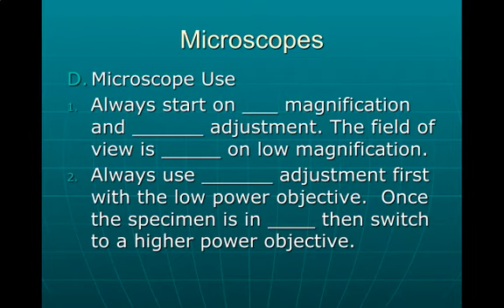Okay, next we're going to look at microscope use. These are rules that you need to apply when using microscopes. Please make sure you study over these rules. I constantly see students using microscopes incorrectly, and guys, it can mess up your experiment, it can cause damage to the microscopes, and it can just be a hassle for those that use the microscope after you. So please make sure that you're looking at these rules, that you understand them, and that you follow them.